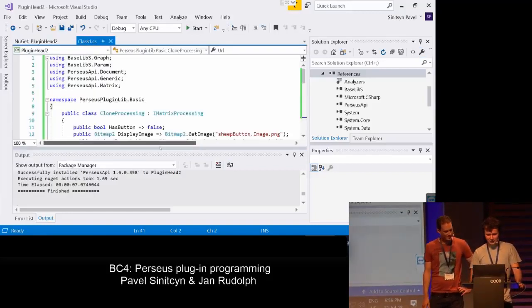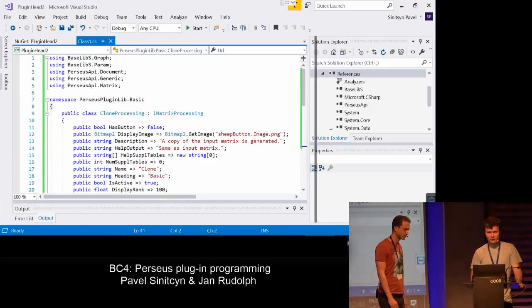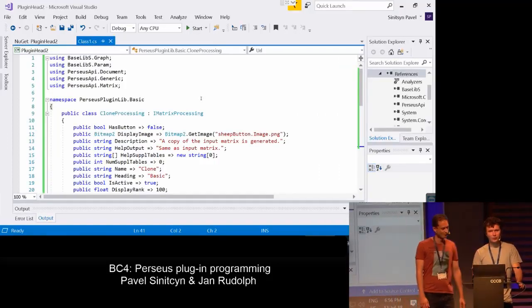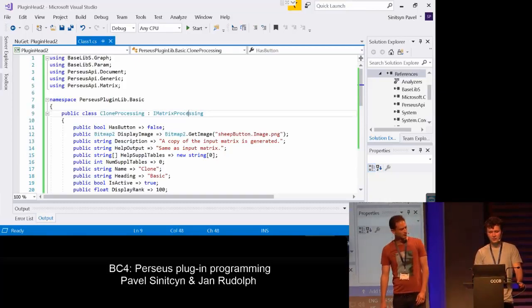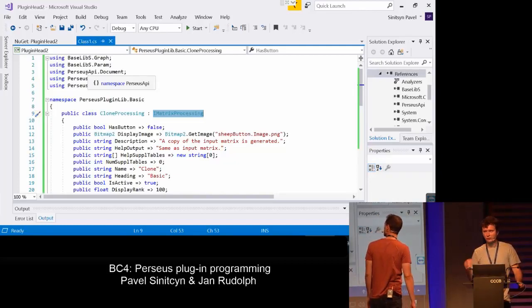So basically, that's a cool thing, you see? No red color anymore. So basically no errors anymore. All these things were found exactly in these libraries which we provided through the NuGet.